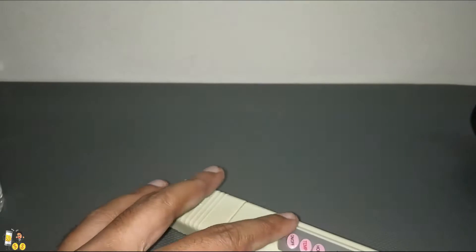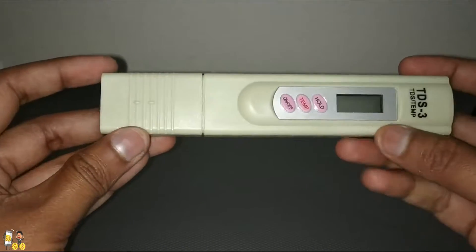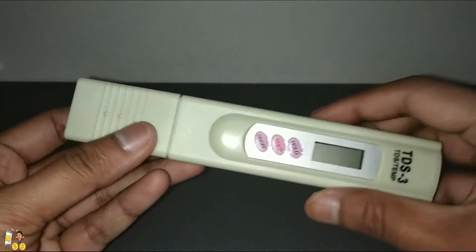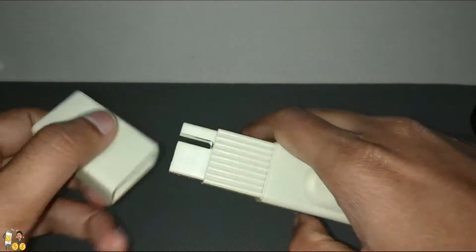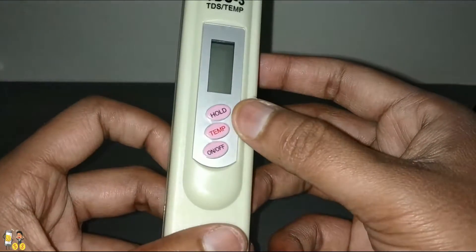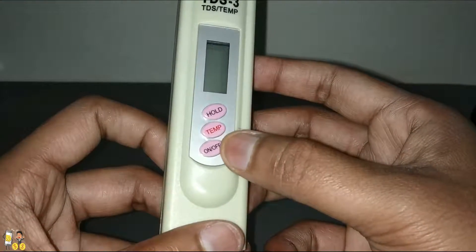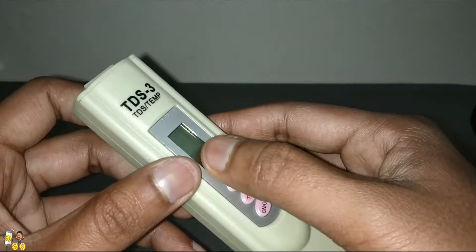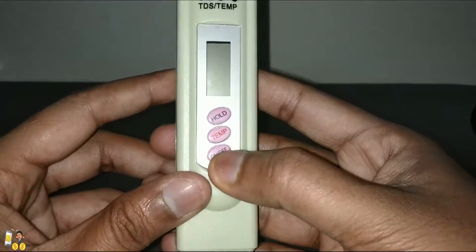Here comes the bill from Amazon. You can see the TDS meter with its protective cap, which you can remove easily. There are three buttons: one is hold, one is temperature, and one is on/off. Here is the TDS meter and here is the display.